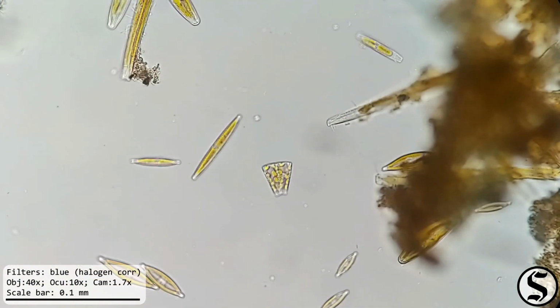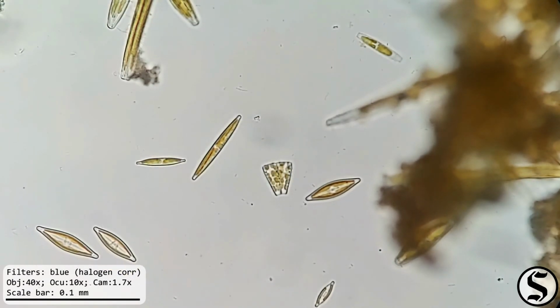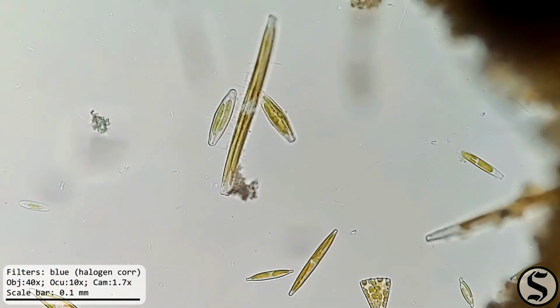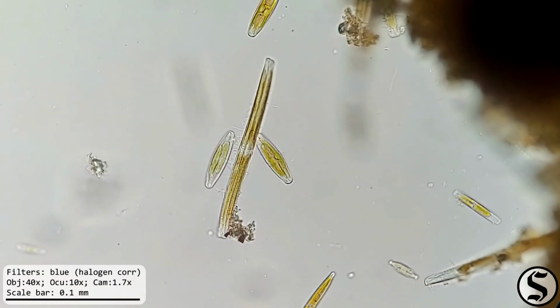Well, I thought this was really interesting. I was not expecting that brown slime to be full of diatoms, but it sure was. Big ones, small ones, crazy shaped ones. Neat. Alright, well I think we'll leave it there for the day.